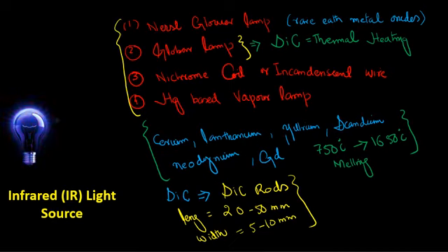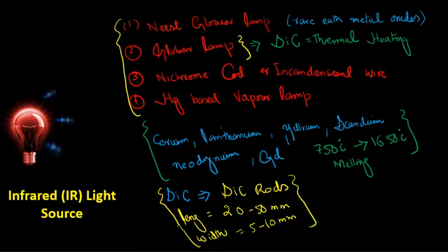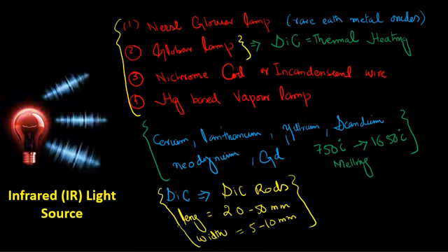So, dear student, silicon carbide is used as an IR source material, and it produces IR radiation when it is electrically heated to around 1000 to 1600 degrees centigrade. Another thing to notice here is that the globar or lamp is combined with a downstream variable interference filter.